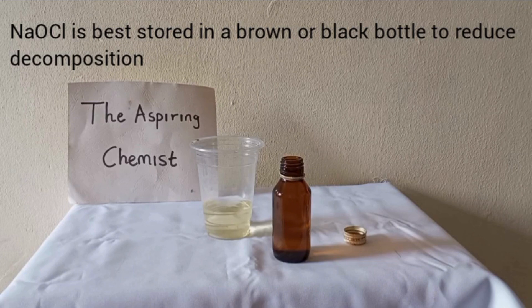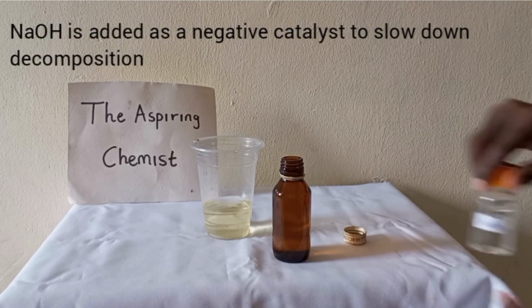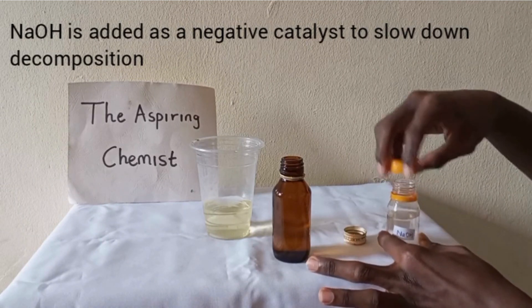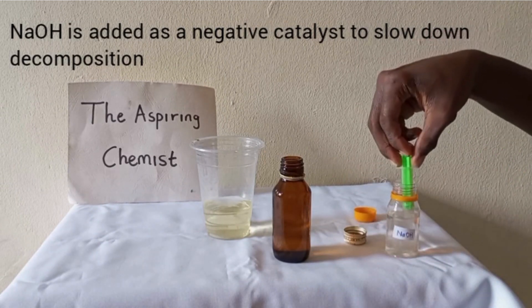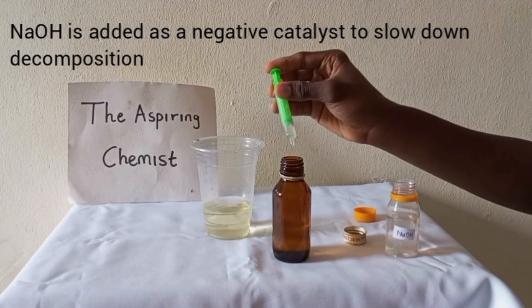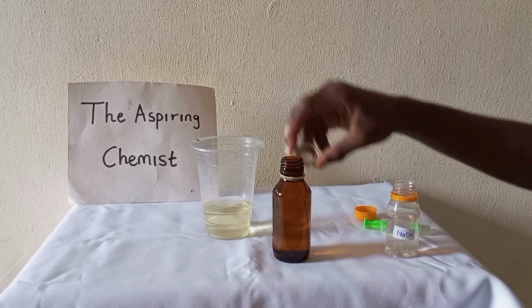Also remember to add sodium hydroxide if you have it. Adding sodium hydroxide helps to reduce the decomposition rate, so just add a few drops of sodium hydroxide to your bleach, then cap it up.